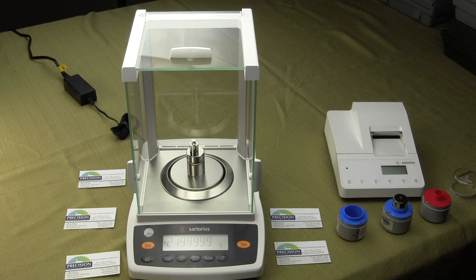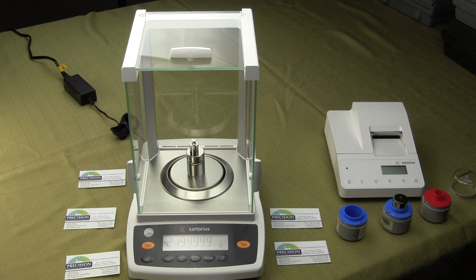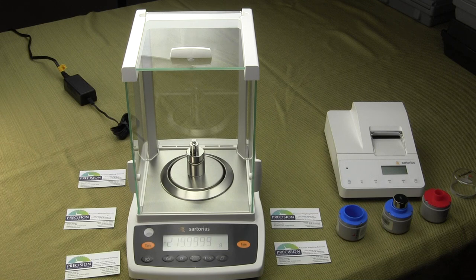Welcome to Precision Weighing Balances. In this video, we'll be demonstrating the new Sartorius Entris Analytical Balance. This model is the Entris 214-1S.